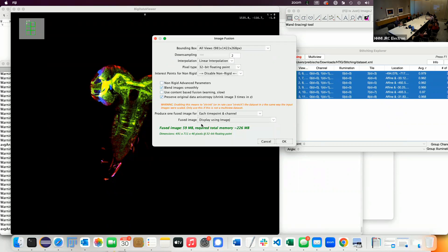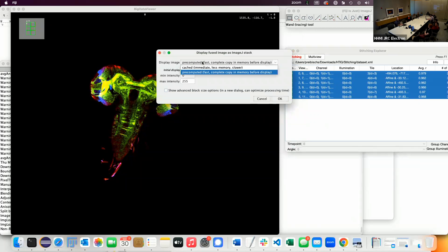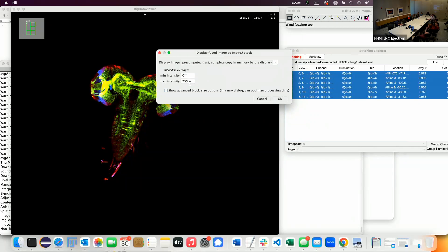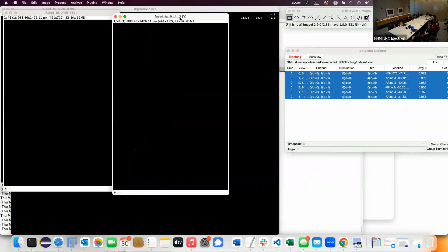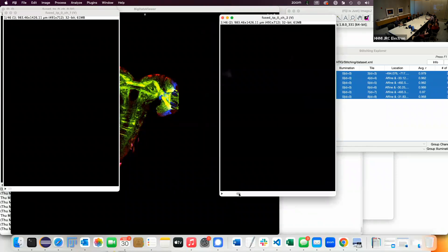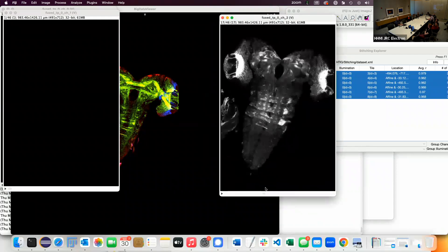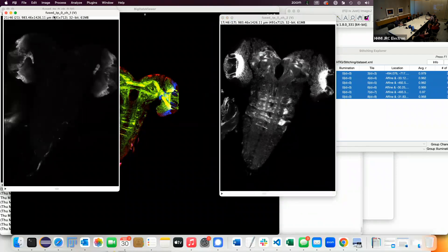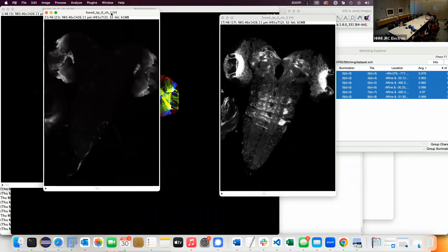So I'll run this now. It asks how you want to display it — you can do a cache display which will show it immediately and compute things on the fly as you go through the dataset, or you can pre-compute the whole thing. It asks for the initial intensity display range and you can do advanced block size options for the caching. I just do the cache display — it shows up immediately and shows three images because it's three different channels. As you go through, it computes things on the fly, which in this case is fast enough — it's multi-threaded. It's a virtual stack underlying that image.